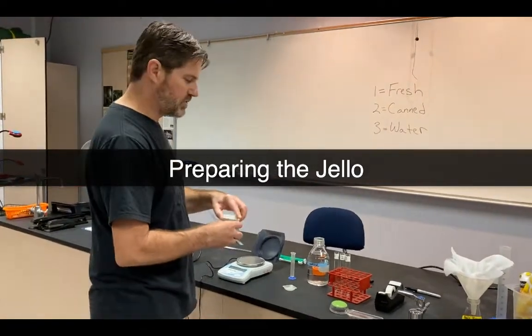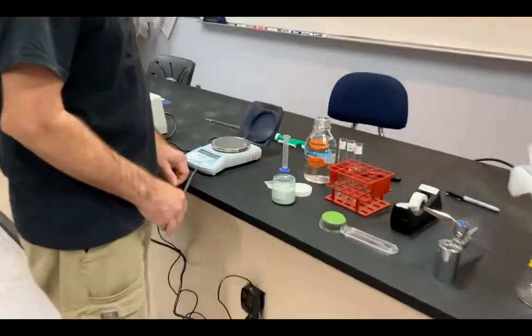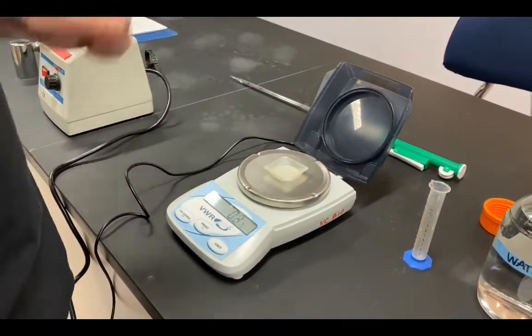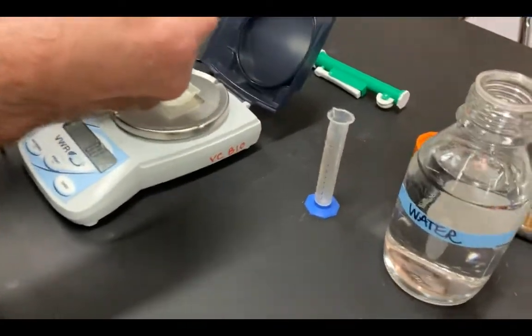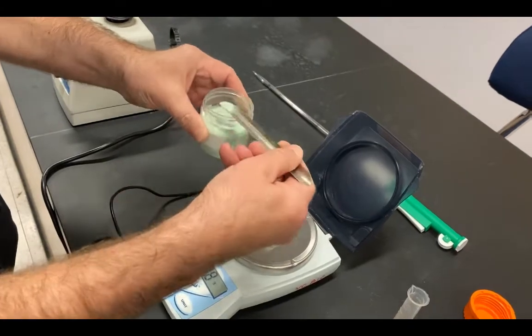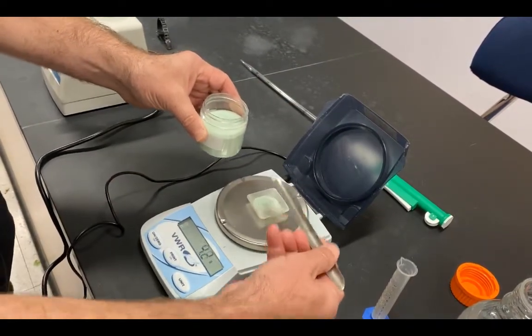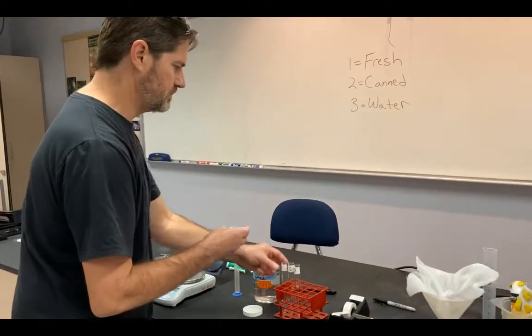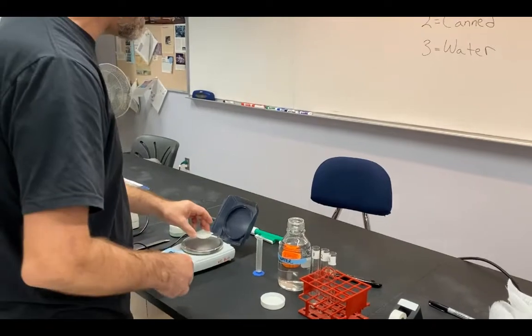Now I'll prepare to add jello to our test tubes. I'll turn on the scale, add a weighing dish, and zero it out to make sure it reads zero grams initially. Then I'll add jello until I get one gram — if I go a little over, I can remove some. Once I have one gram, I'll transfer it into a dry test tube so it doesn't stick to the sides, and repeat that for each tube.